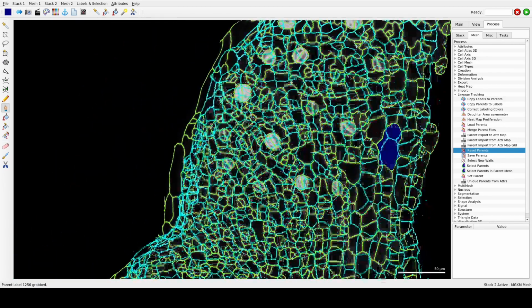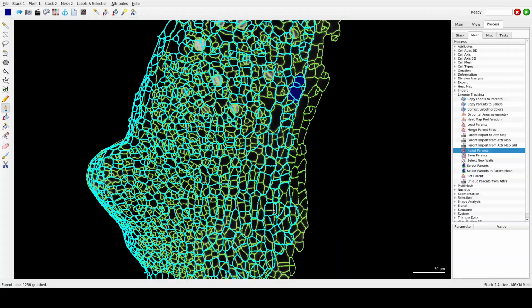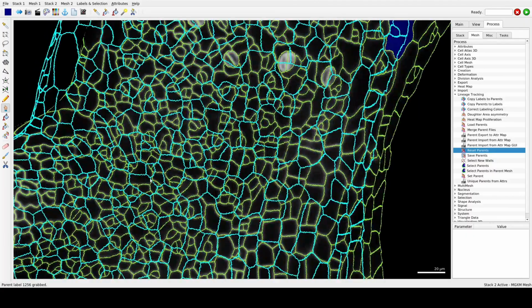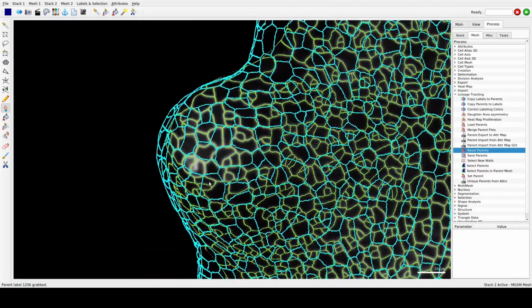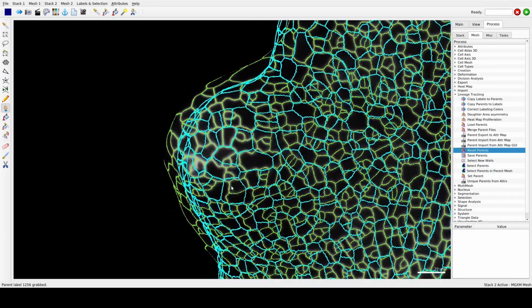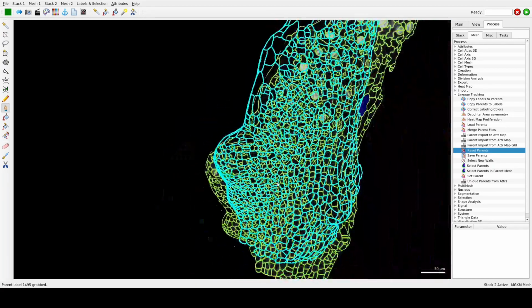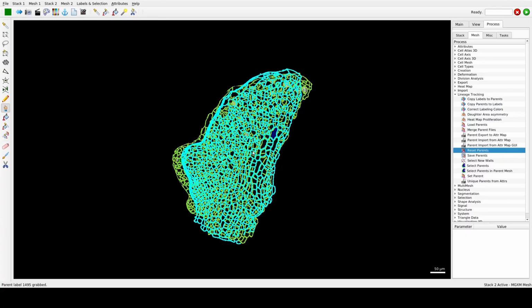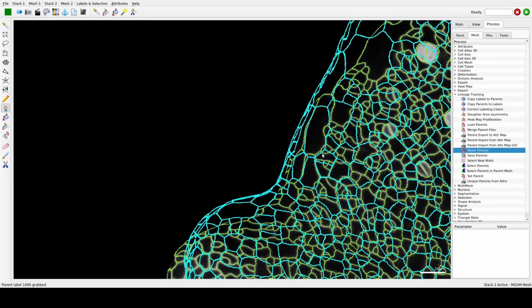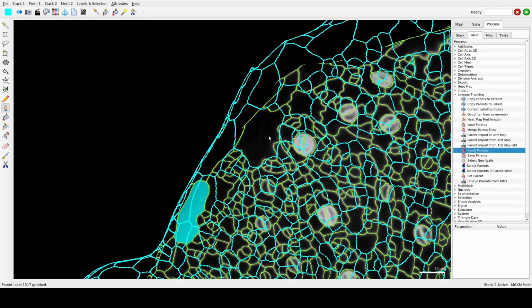Here. Somewhere here. And this one here.